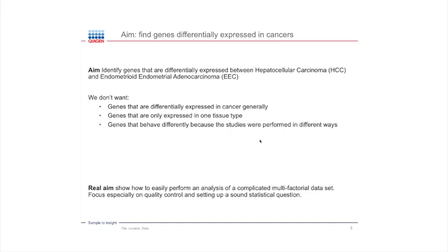But if not, then just bear in mind that these two cancers, the same principles apply if you have the same cancer in two different stages and wanted to compare those. Or if you wanted to ever do a correction for batch effect so that you could compare your data against some data somebody else has produced, or even some data that your own lab produced on a different sequencer or with a different postdoc in charge, for example. So there are some very general principles, which is what I really want to focus on here.